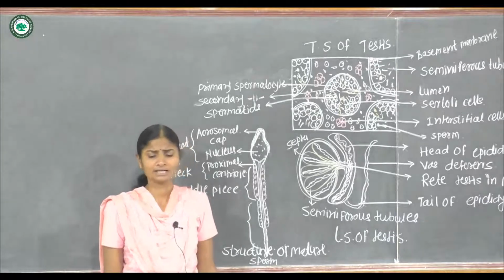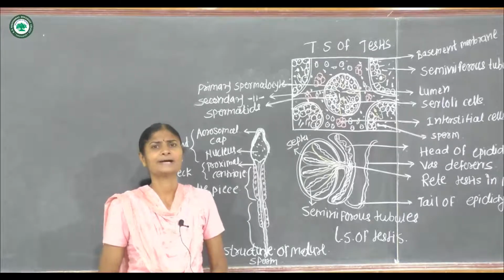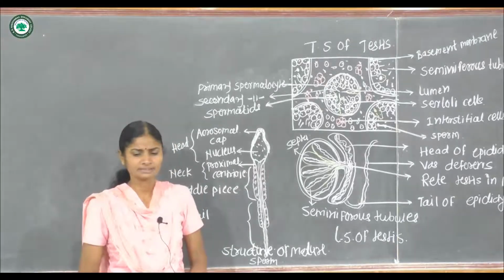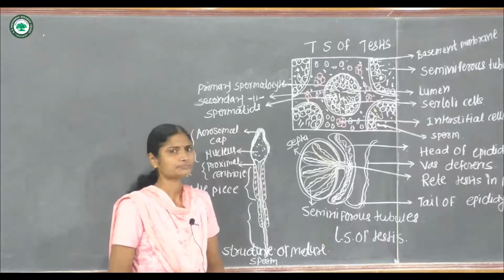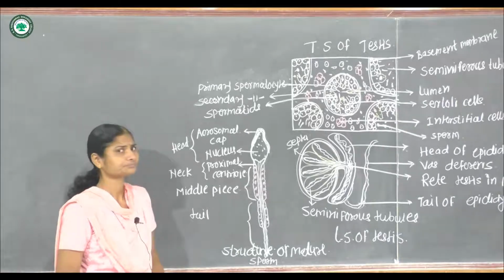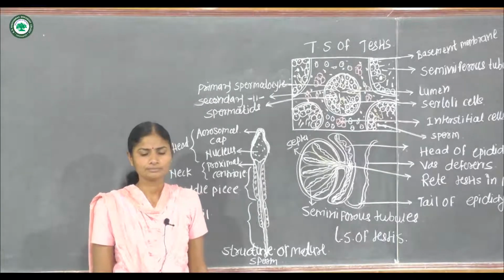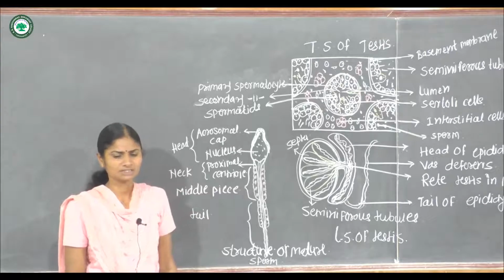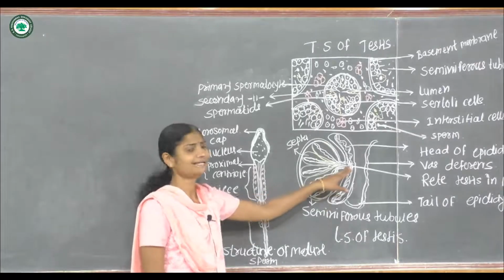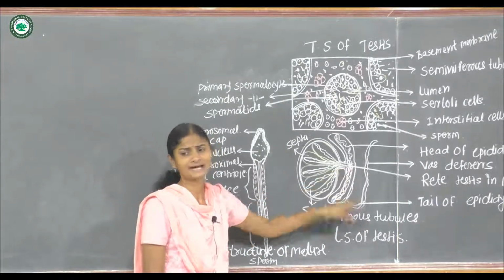Below this tunica albuginea, a loose connective tissue layer is present, richly supplied with blood, and this layer is called tunica vasculosa. The tunica albuginea of the posterior portion of the testis is greatly thickened at the middle region, and this region is called mediastinum.